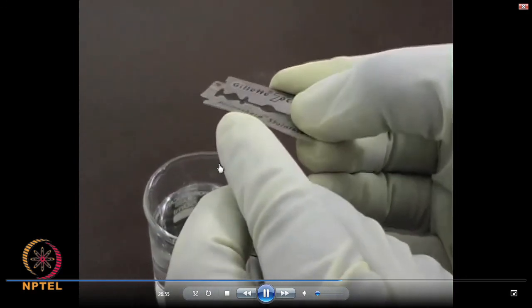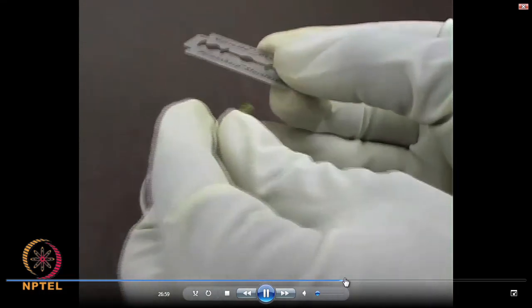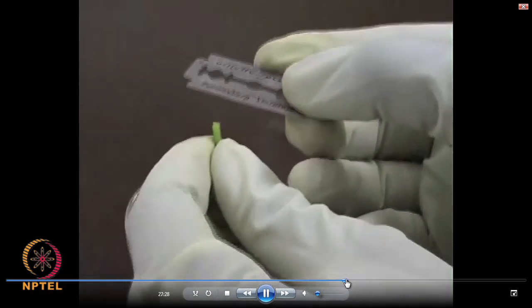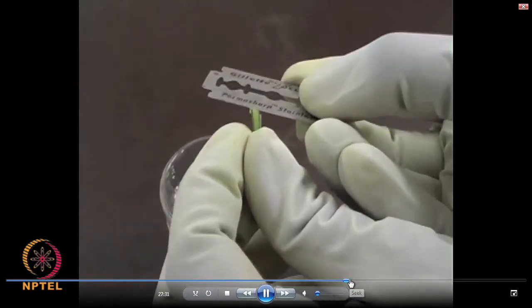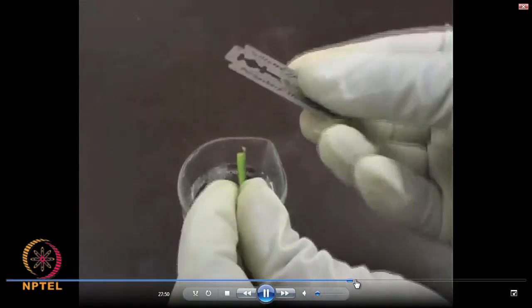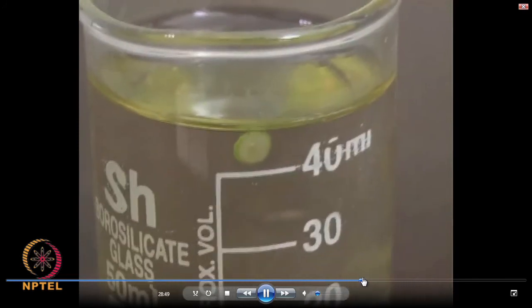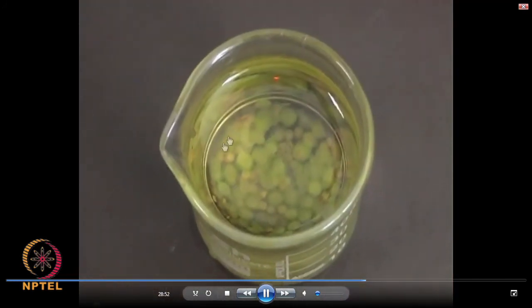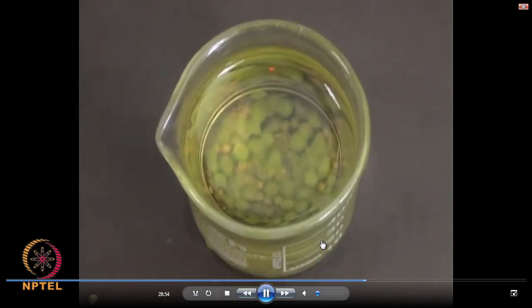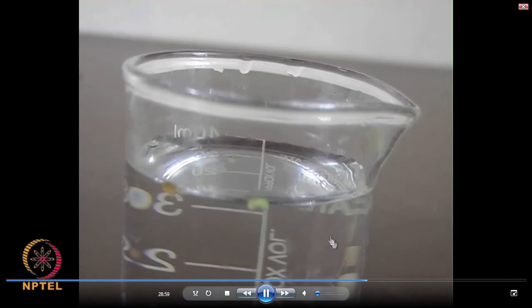The earlier one was a banyan tree root, and once you make slices and collect them in the beaker, you have to choose only very thin and transparent samples for the examination. The one which is floating on the water is most suitable and good for microscopic analysis.